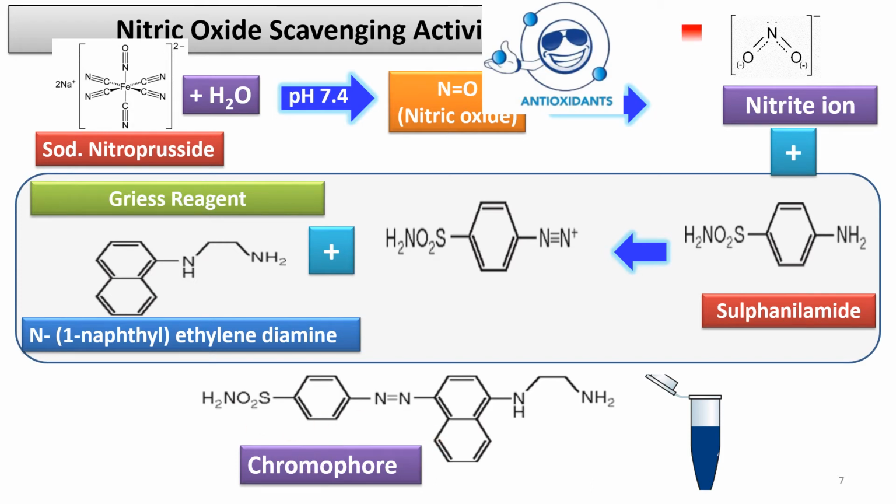Instead, the test tube will appear in this way. It will be colorless, or depending upon the antioxidant potential, if you have added more or if your antioxidant is too strong, it will form a colorless complex or colorless solution.